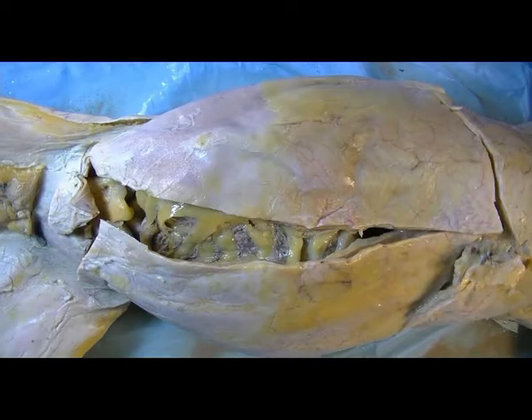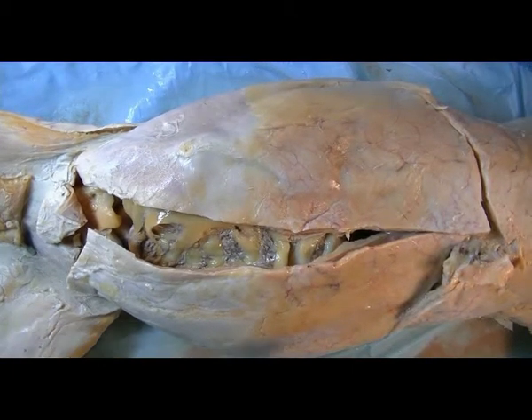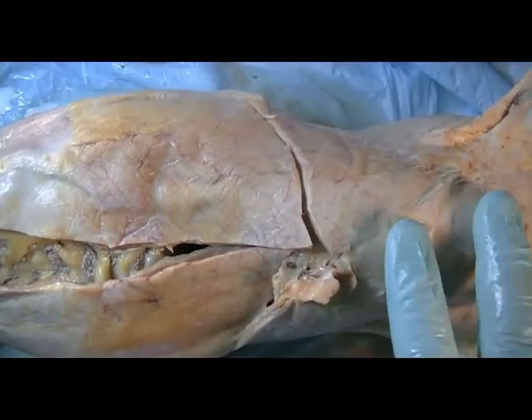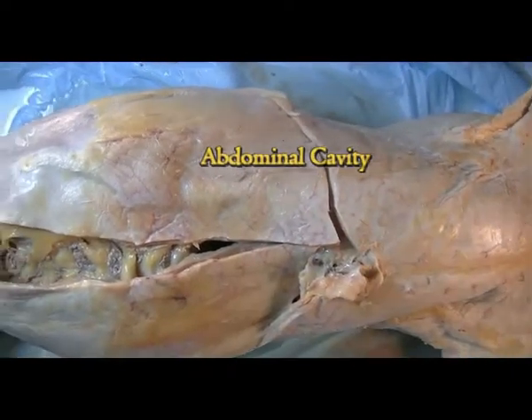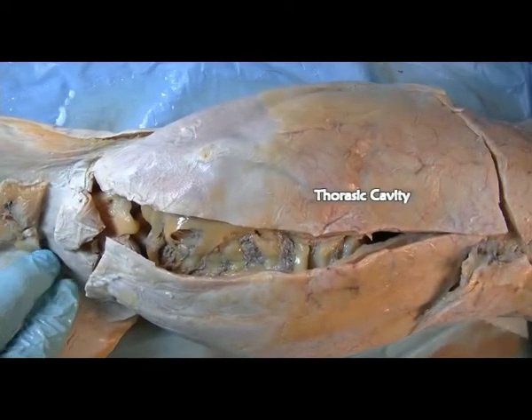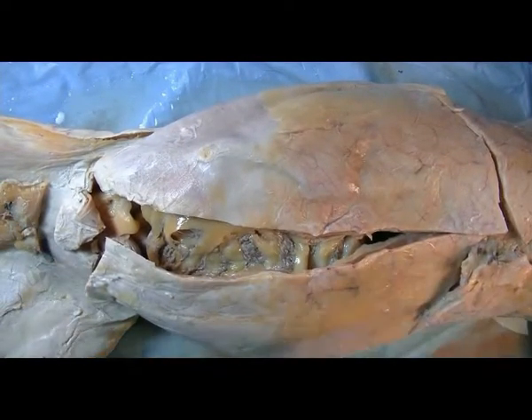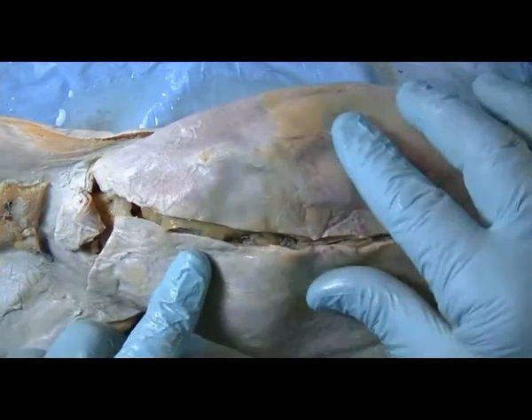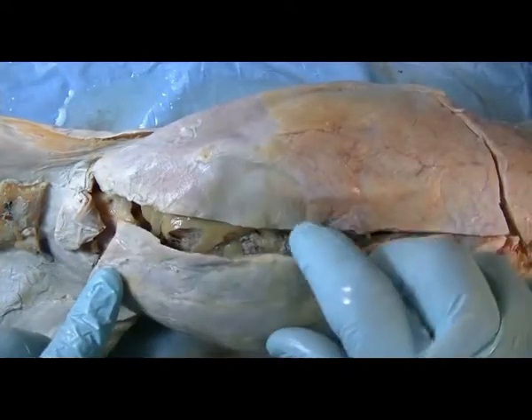Today I will show you the digestive system of the cat. Here I am pointing to the abdominal cavity of the cat. Superior to that is the thoracic cavity where the heart and lung are located. And more inferiorly down here would be the pelvic cavity. And where the head is would be the cranial cavity.